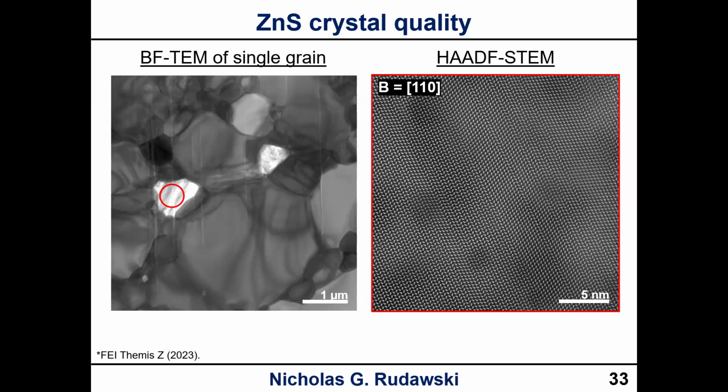So the zinc sulfide, depending on how it's stacked, you can have different structures, okay? So you can have a wurtzite structure depending on how it's stacked. So that's actually what you're seeing if you look from right here, where my mouse is, to right here. This whole block is wurtzite zinc sulfide. But then right here, there's a switch, and from here to here, it transitions and becomes zinc blende zinc sulfide, okay?